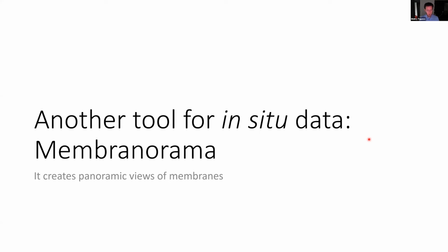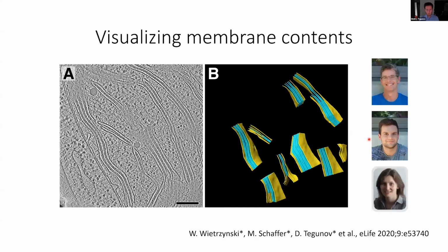So this is a piece of software that I wrote for visualizing the organization of membranes in situ. Usually if you acquire an in situ tomogram and you want to look at those membranes, you have a big problem.